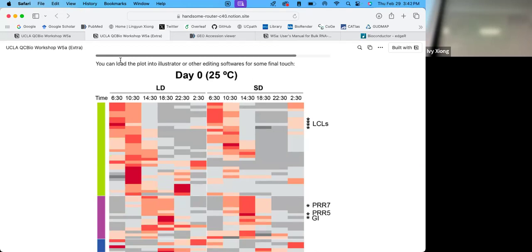I have to go, I was trying to go back and finish off the pipeline, and I got an error in the job. I guess it was what I specified. So I tried, this is the first receive files, and then we have to look into this. Change this, I didn't change anything else.